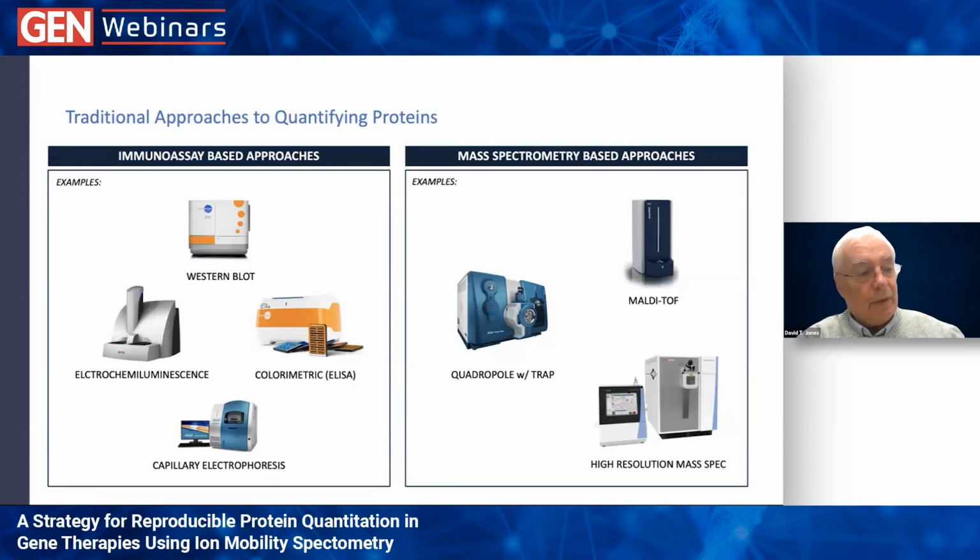So it's a very, very powerful tool, and it's becoming more and more powerful, because right now we're looking at traditional mass specs, high resolution and quadrupole mass specs, but there are a number of hybrid mass specs that actually add more dimensionality to the separations of proteins. So you're really getting the thing that you want to look at and really understand its presence and its behavior.